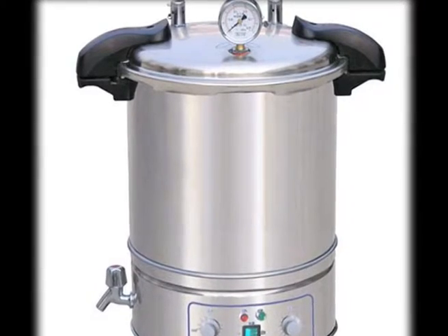In this condition, if we maintain the things to be sterilized for 15 minutes, then all the endospores and viable microorganisms are supposed to be killed. But this duration might be increased if the volume of material to be autoclaved is increased rapidly.